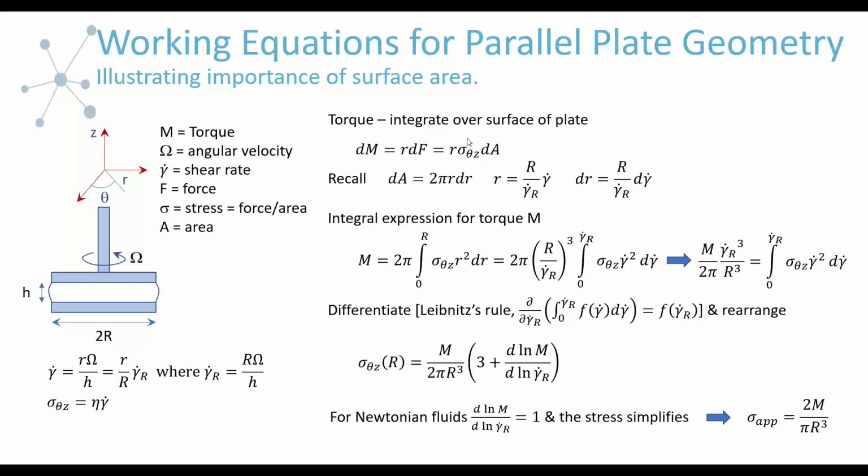So this is where, if you have very high viscous stresses due to, say, a high viscosity fluid, you don't want a large surface area because this will lead to a very high torque and then will lead to the situation where you overload the instrument. So if math is beneficial to you as it is to me, this is a very clear relationship between torque and the viscous stress and the area increment.